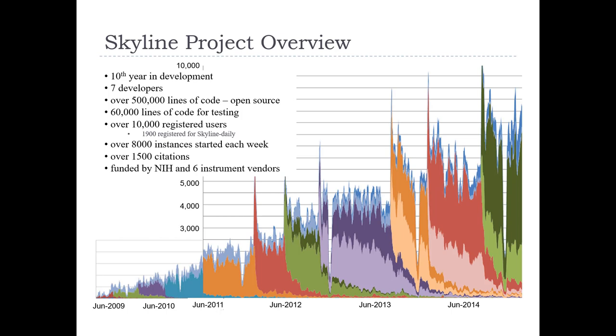It is cross-platform, cross-instrument, as Sue said. It allowed the CPTAC program to look at all their data in the same place. It also allows people who master Skyline to go from lab to lab and keep those skills no matter what instruments were being used in those labs.